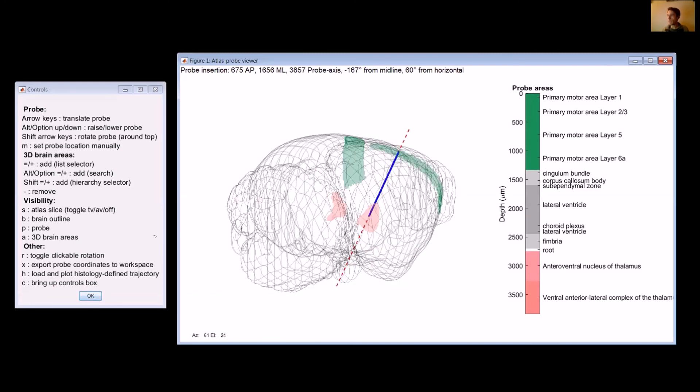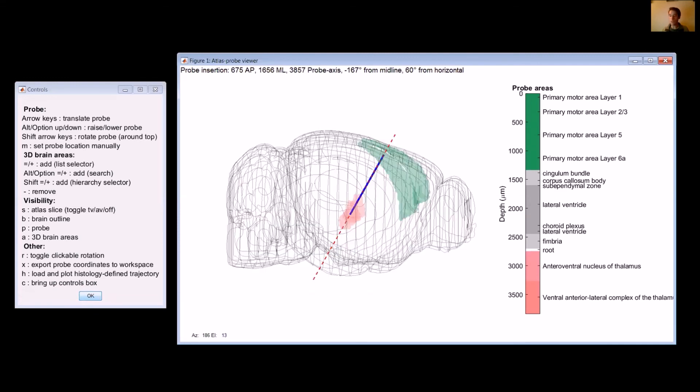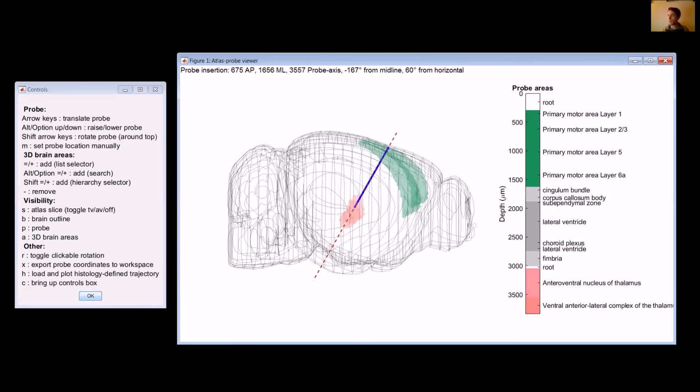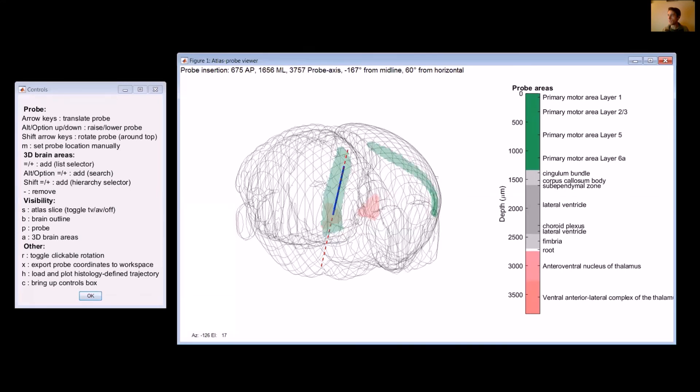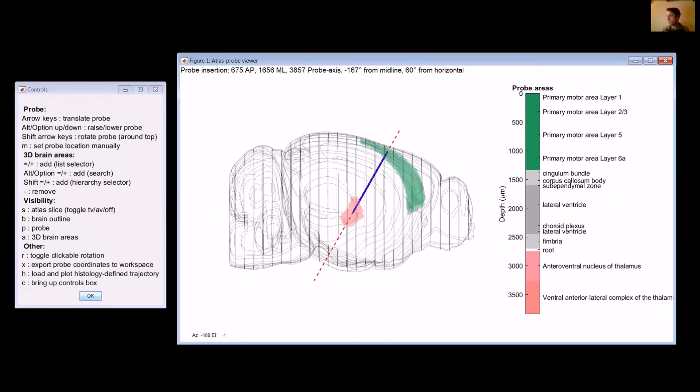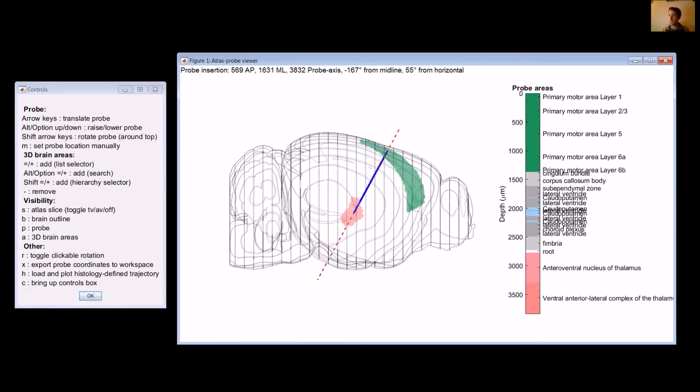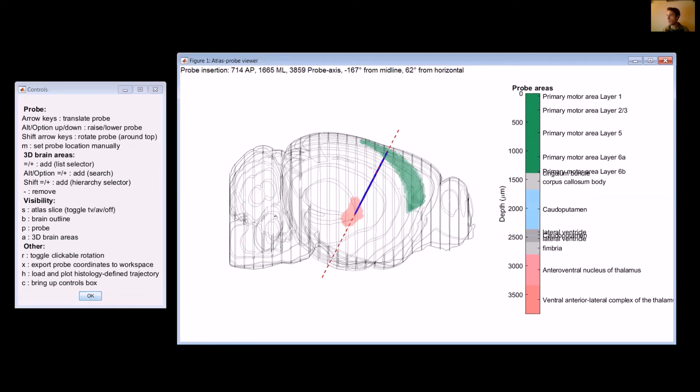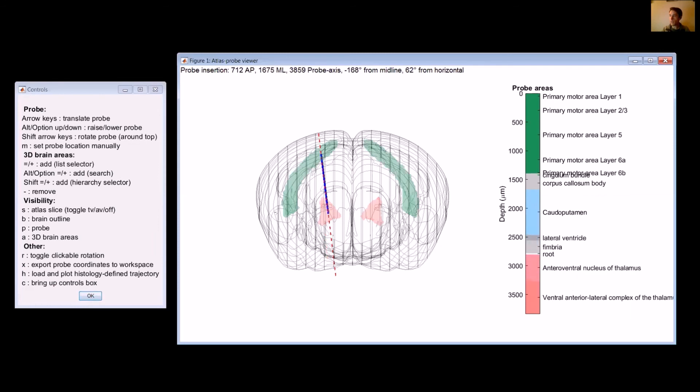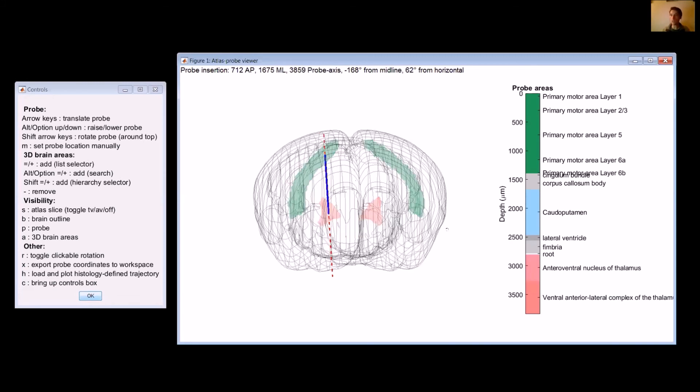Once you play around with it, it kind of gives you a better feel of where these things are in space. You can also put it at one view, for example, and optimize your angle this way. So I've just put the kind of sagittal view of the brain here. And then you can move the angle independently. So like this, you know, I can make it so it hits the biggest chunk of the cortex, and then you can move from the front and set the other angle. So that's going through the biggest part of this. At the end of the day, it kind of just takes a little bit of practice to get used to. But once you get used to it, hopefully, it's relatively intuitive.